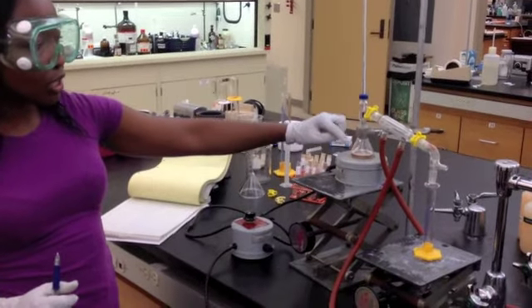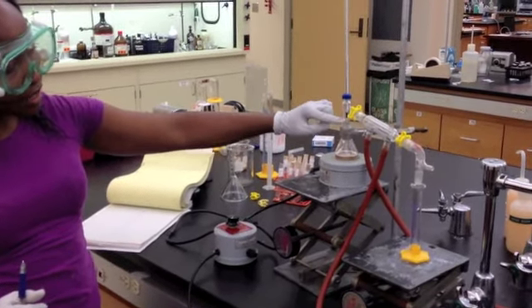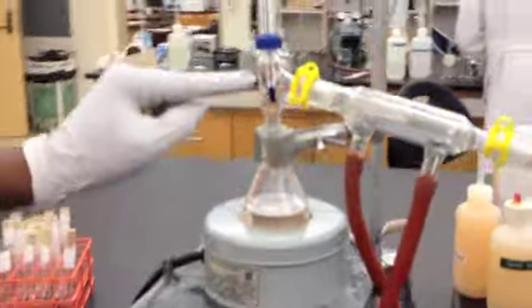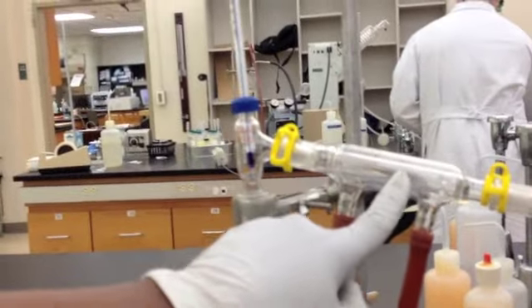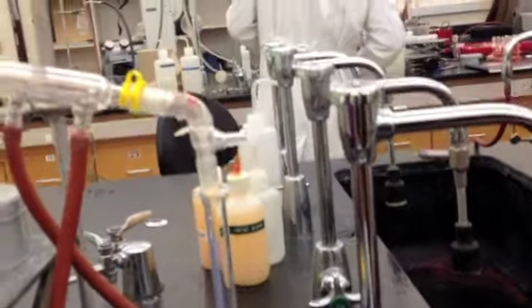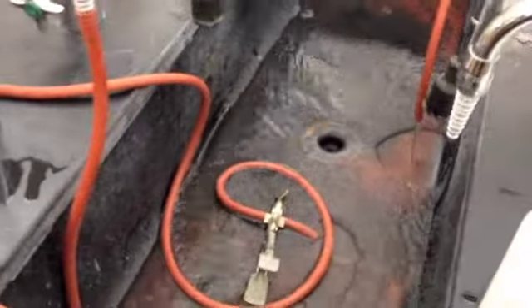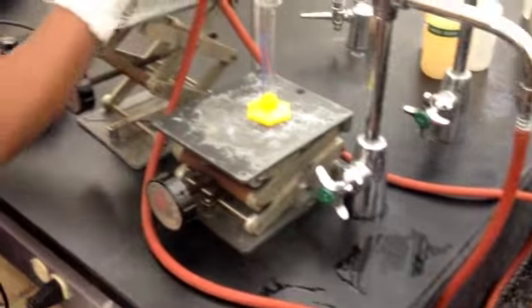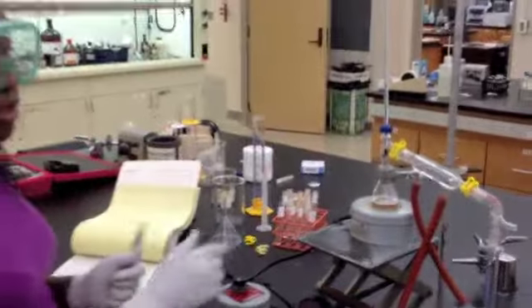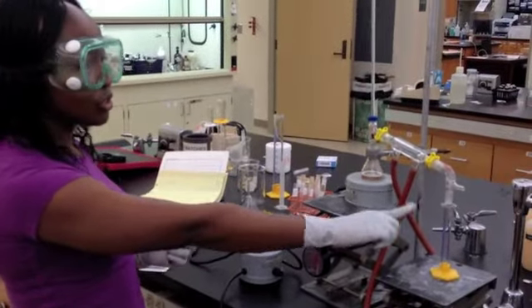When the solution starts boiling, you'll pay attention to the reflux, and you'll wait until you see the reflux reaching where the thermometer is. Once it reaches there, you'll notice that it condenses through the water condenser. As we can see, the heat is going through, and I have my jacket condenser running. Now we'll wait, and we'll show you the next step when the solution starts condensing and we start measuring the readings.